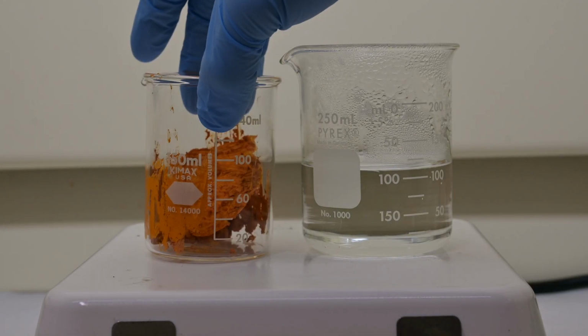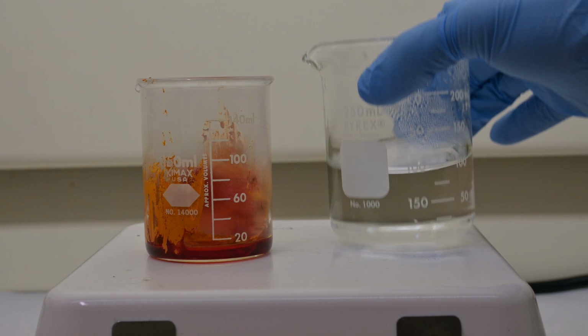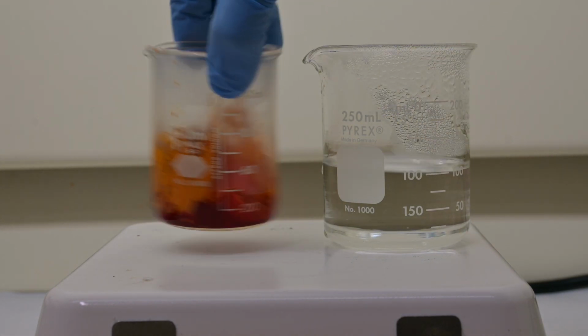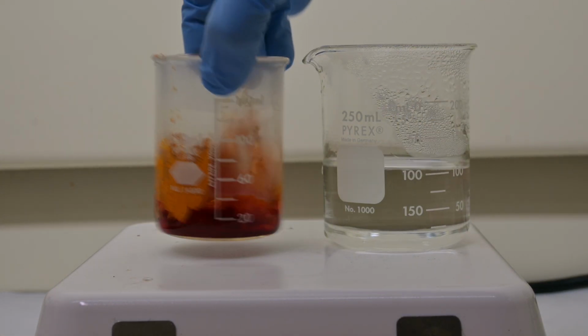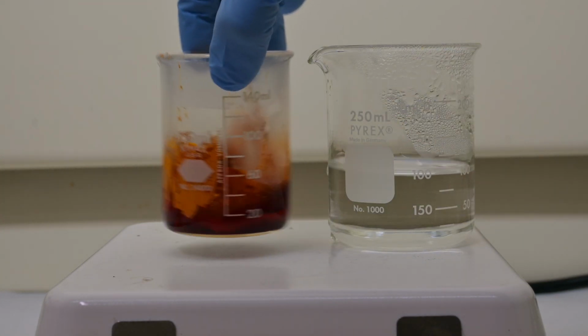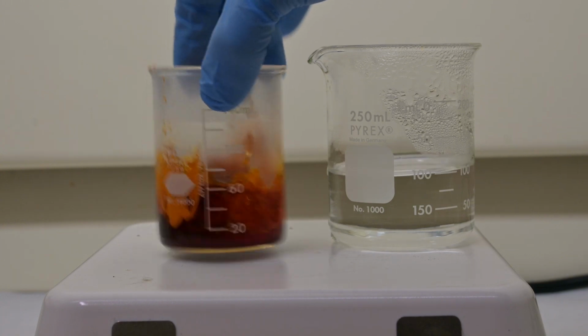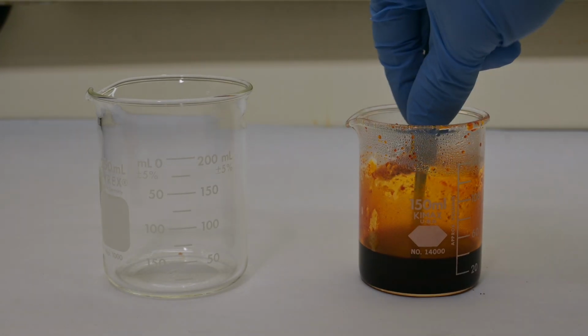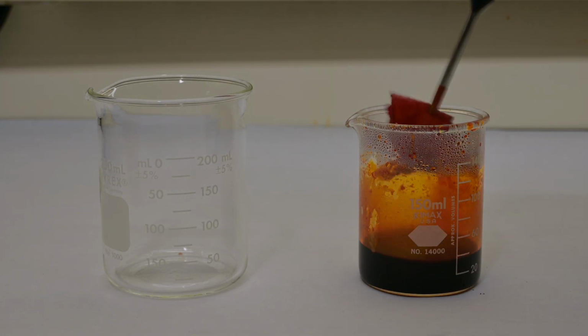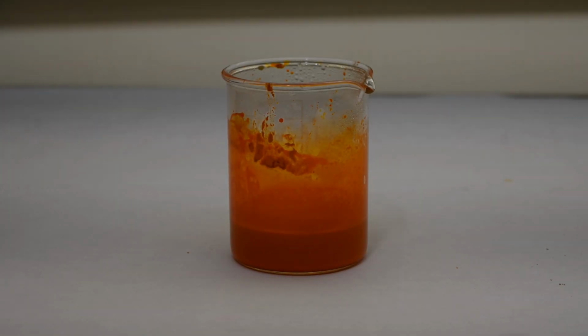Using boiling water, we add it to a beaker containing our crude methyl orange, keeping it warm on a hot plate. It takes around 10 to 12 milliliters of hot water per gram of material. We want to add enough to dissolve all the methyl orange, but not so much that we lose product by leaving it dissolved while filtering. We then set the beaker off to the side to cool. The methyl orange is pretty insoluble in cold water and starts to crystallize out.